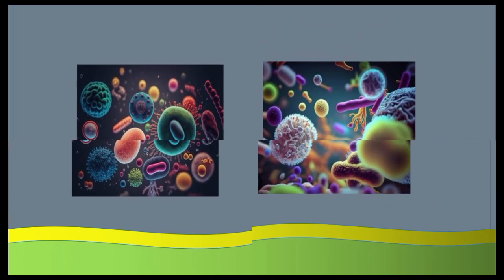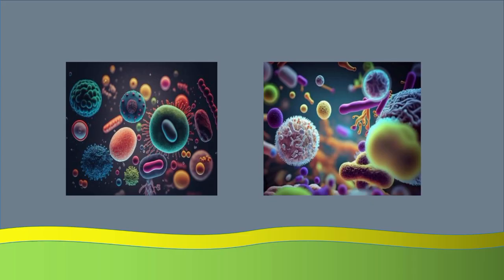Take a look at the picture. What do you see? Very good. It is an organism, or the bacteria. How can we see this tiny organism? Yes, we can see it by using a microscope.